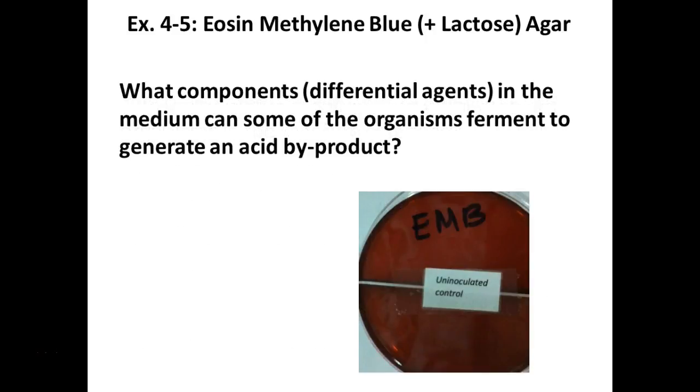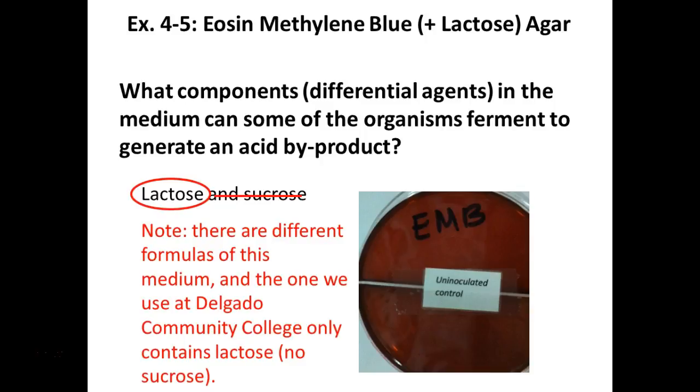What components make this media differential? What are the organisms going to ferment and produce acid byproducts from? Sugar. What sugar? Lactose. Right? You can buy one with lactose and sucrose, but remember for our lab, it's just lactose.